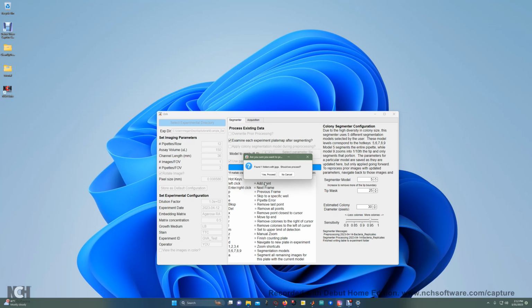So if you picked, say, the documents or the pictures folder on your computer, and it has all your GVA pipette tips, but also hundreds of folders of cat pictures, this will not be able to distinguish which ones are GVA pictures. Right here you would see some crazy number, like you have 42 folders with JPEGs. If that does not sound correct, then you need to navigate into a more specific directory.